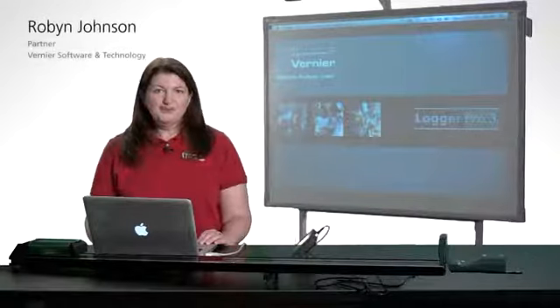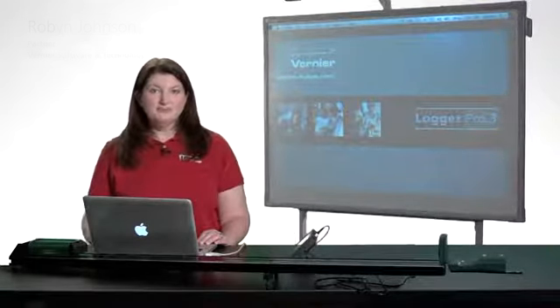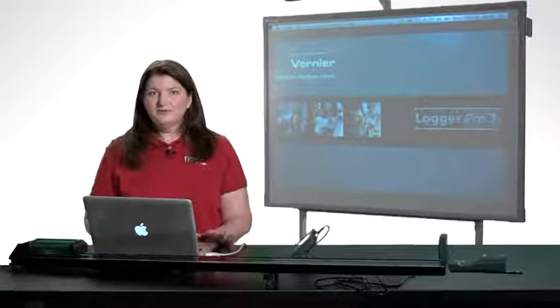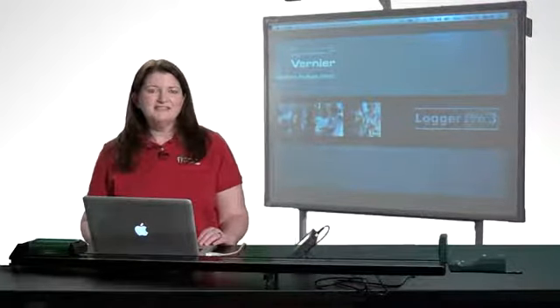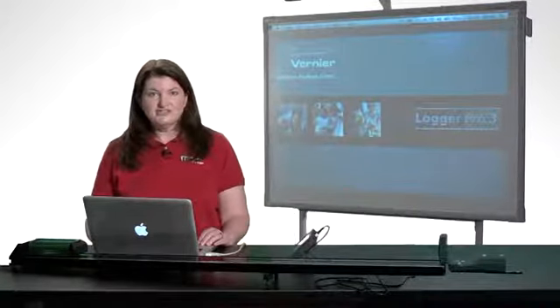The LabQuest viewer allows you to view and control a LabQuest screen right on a Windows or Macintosh computer. This is very handy in the classroom, as you can display your LabQuest screen from a demo in the front of the class, or maybe show one of your student groups' LabQuests up for the whole class to see. You can also use the viewer to make screenshots for lab instructions, things like that.